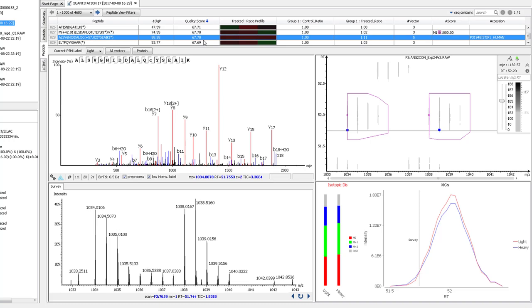The bottom four figures show the best annotated MSMS spectrum to give an idea of the identification quality. A heat map of the actual peptide features shows the actual data used for quantification. The pink shape shows the area determined to be the boundary of the feature.